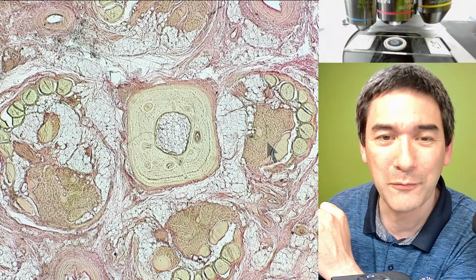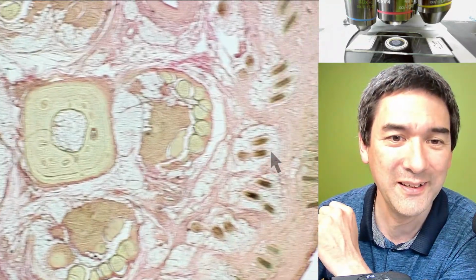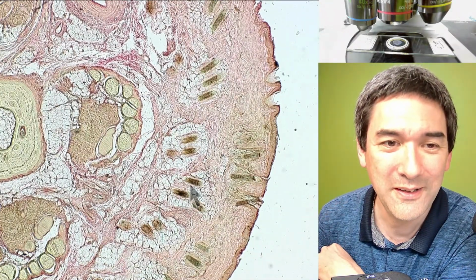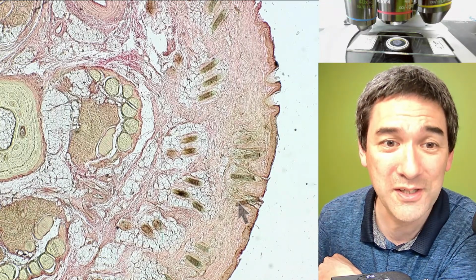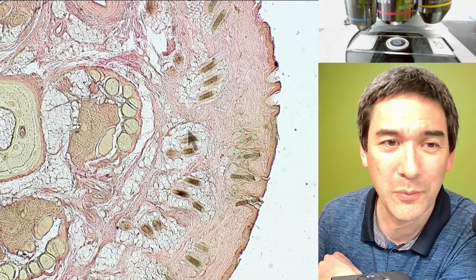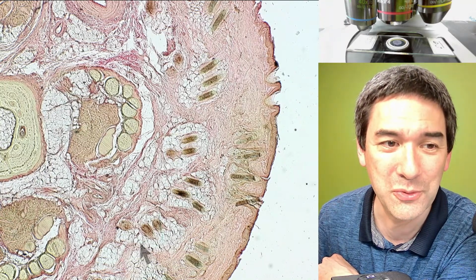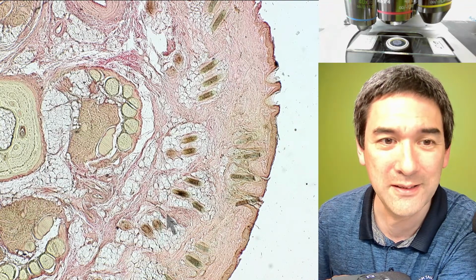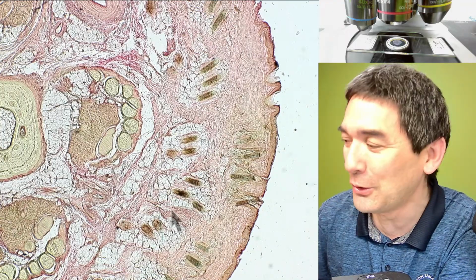You've got over here on the side those things that you see here. These are basically hair follicles for the fur. So you actually see that there was fur growing out here. What you have surrounding here, these are most likely fat tissues as well, which are keeping the fur fatty and greasy to repel water. So there are lots of interesting things.